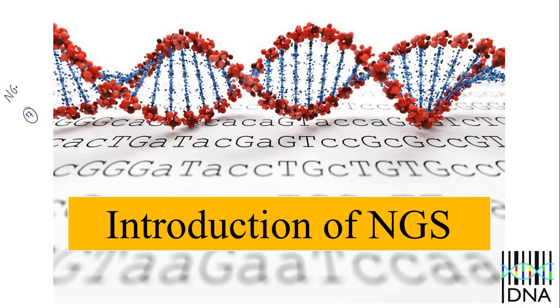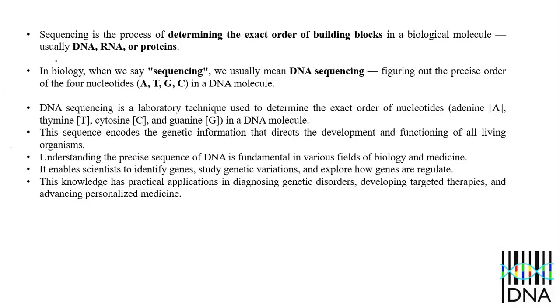NGS is next generation sequencing. This is the first session of this training program. In today's session, we discuss the overall idea of NGS. We discuss what sequencing is, what the types of sequencing are, and what the generations of sequencing are, meaning the basic idea about sequencing.